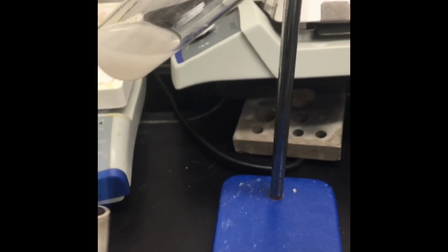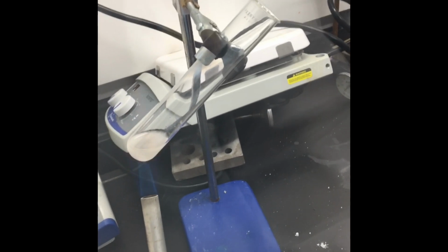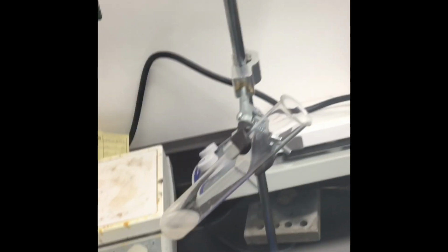So what I've done now, I actually have a bigger test tube. I'm gonna show you right here, a bigger test tube. I put about double the amount of potassium chlorate, but now I'm going to use a different kind of gelatin sugary treat, and I had to use something bigger, because I'm going to use Swedish fish. So let's see how this one works. I'll make sure that I have my gas off, and let's drop it and see what happens.